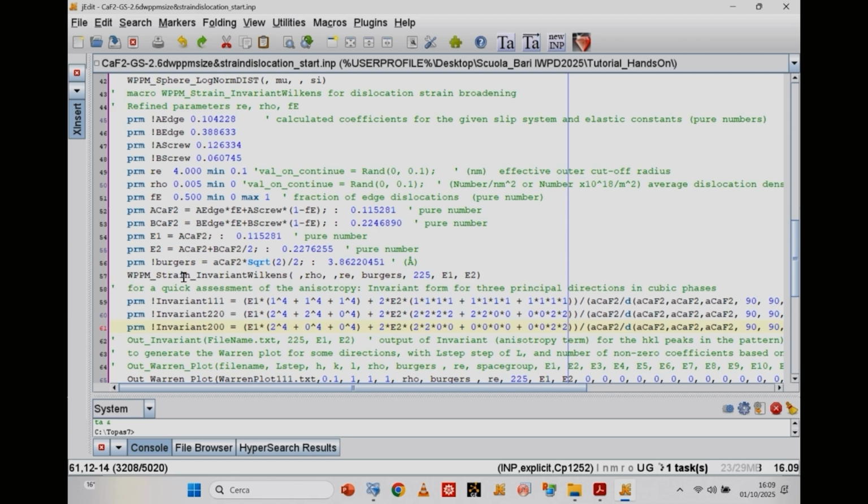But it is not something standard, but you find many papers where these have been calculated, and maybe your material is isomorphic, so you can at least have a reasonable starting point. If your material is cubic or hexagonal, you find tables for these coefficients, so you have the right thing.